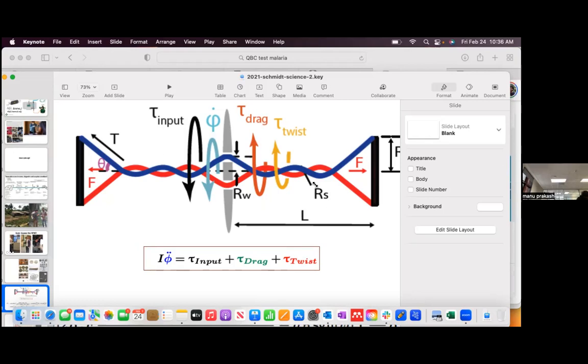And then the other thing that I will do, because I know how fast we can make them go, is wear safety glasses, because it's always important to protect your own eyes, although kids don't usually do that. And is there a pen?